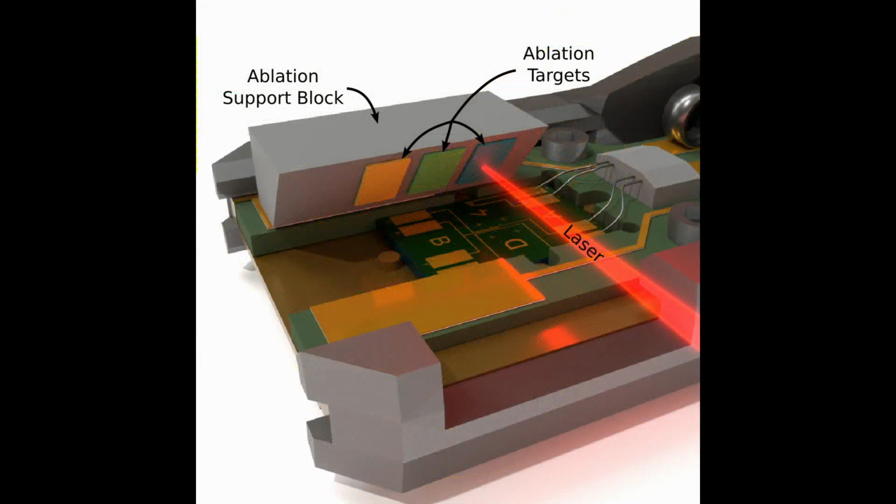An alternative strategy could be to use in situ pulsed laser deposition. Here, the laser could enter the microscope through a viewport and be focused onto a target to evaporate it. In our concept drawing, we furnish 3 different targets, which would enable the user to switch elements on the fly.